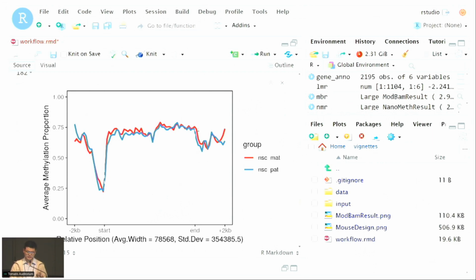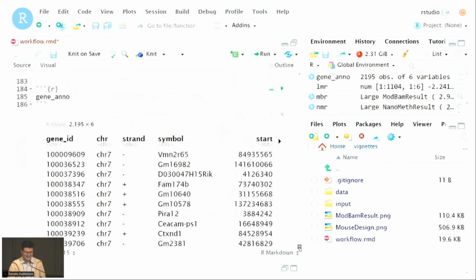And what you would see quite clearly is that for active genes, the methylation through a gene body is actually higher than the background level. So for active genes, you expect to see a big dip in the methylation near the transcription start site, but you actually have an increase in methylation throughout the gene body. Previously, I've done analysis where I aggregate methylation across the whole gene body, and now I'm worried about all the signal that I canceled out doing that. But that's not of your concern. We'll just keep moving forward.